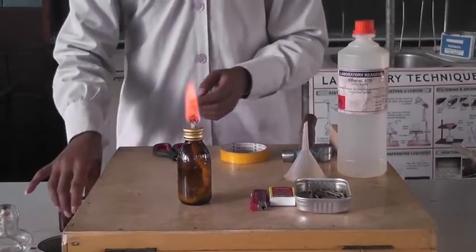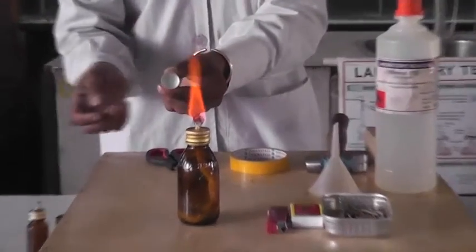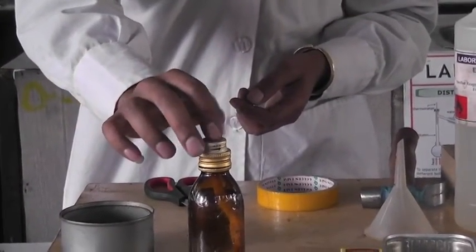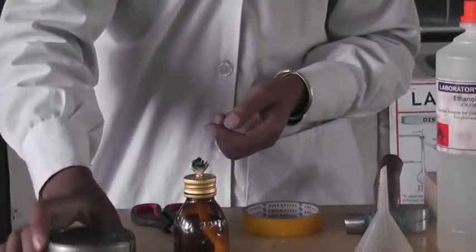After that, how do we put off the light? We can use another cup or a different kind of material to extinguish it. Let's see how to put off the light — we can use this to put off the light.